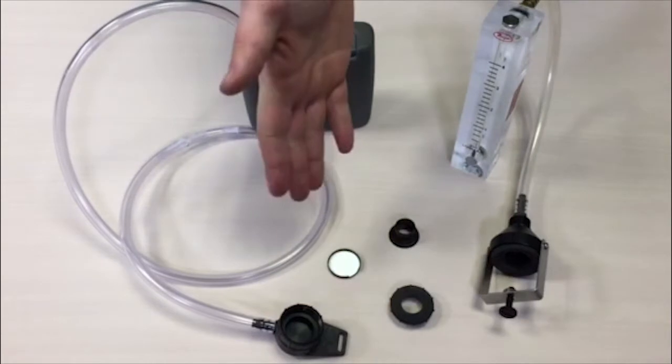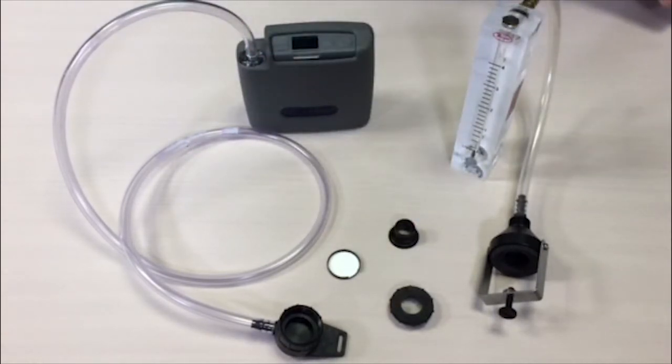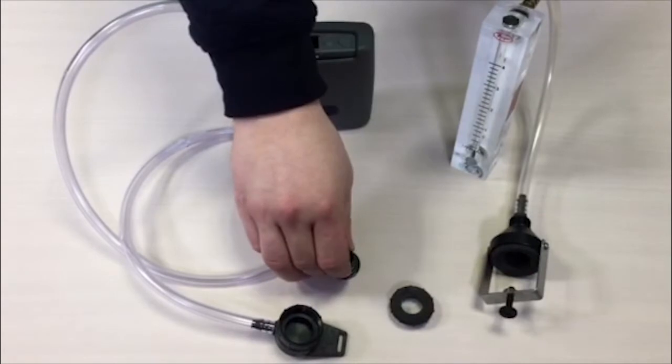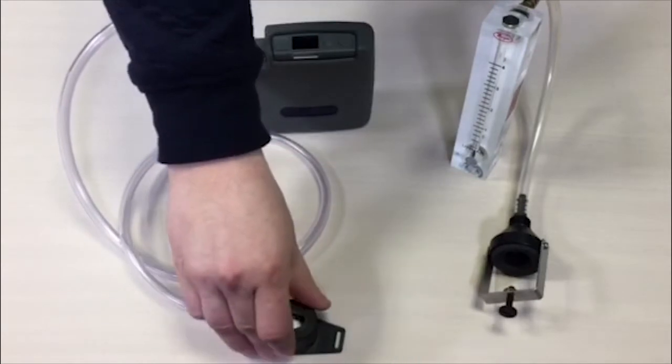The pump should be calibrated with the filter already in the sampling head. Care should be taken with the filter as they are all pre-weighed, so it should be done in a clean environment. Use tweezers to handle the filter and ensure it isn't damaged. Filters are housed in a cassette which is then assembled to go in the sampling head. Once assembled, ensure it is securely tightened and fastened together.